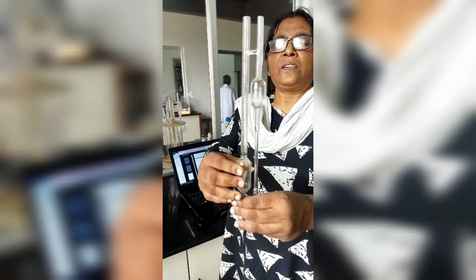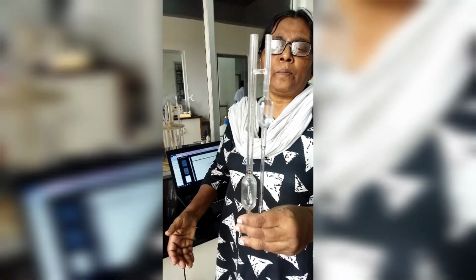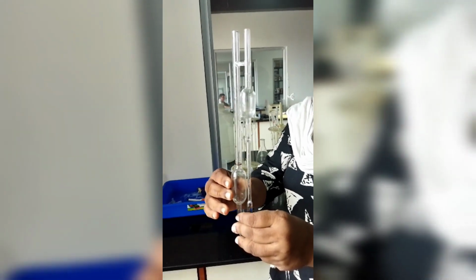This is a viscometer, the one which will be used for measuring the time of flow. Now you are asking me what flow. You see there are two bulbs, nothing special here. The smaller one and the slightly bigger one.